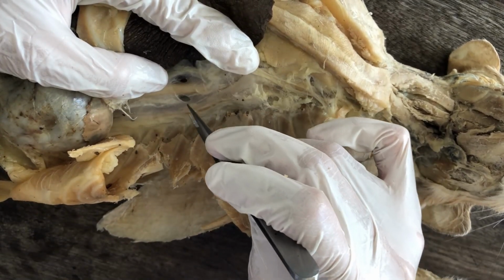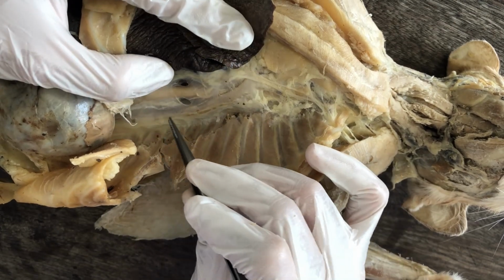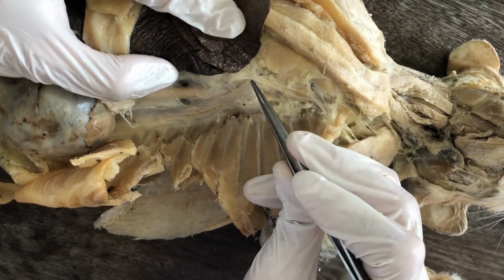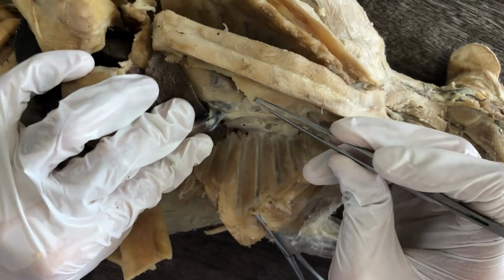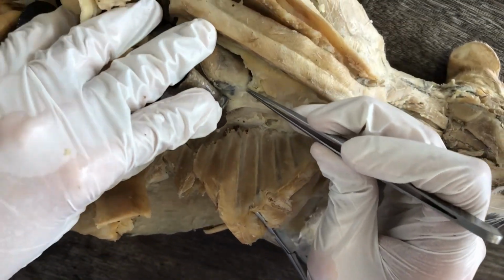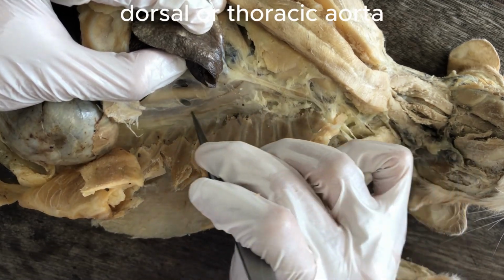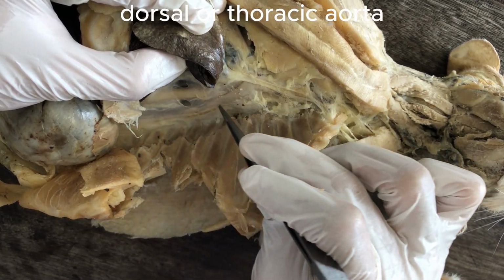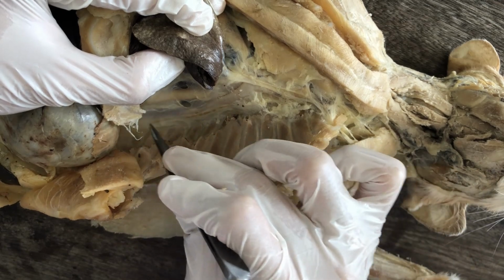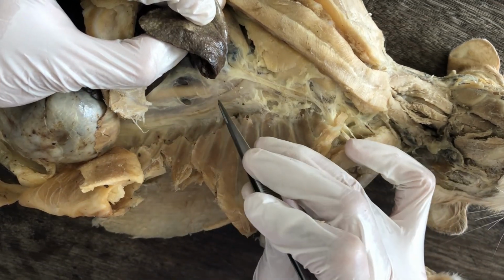And the one more dorsal, this one, if you trace it, it's actually arching and going to which structure? The heart. So from the heart, it's arching like that. That's the aorta. Specifically, this portion is the thoracic aorta, sometimes called the dorsal aorta. So dorsal aorta, that white tube there.